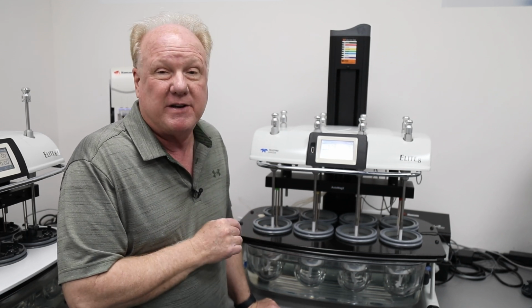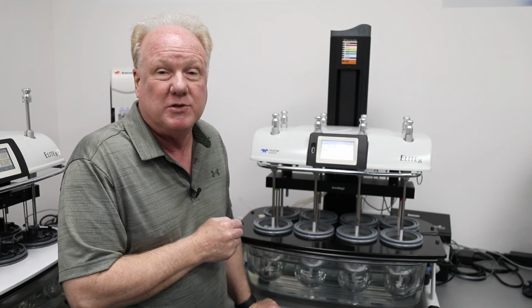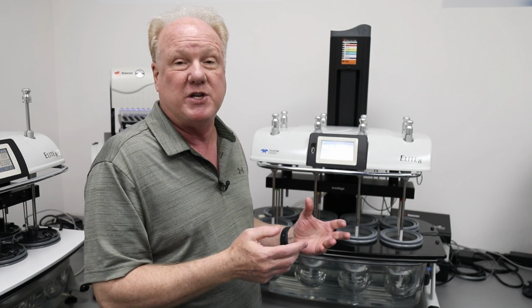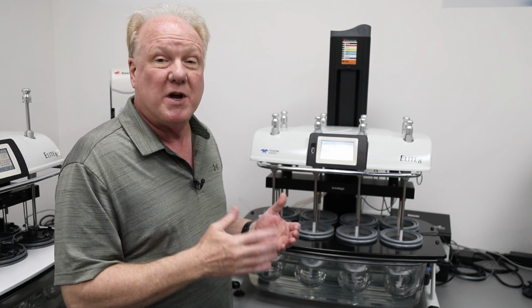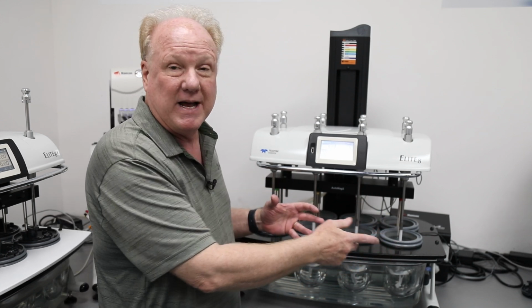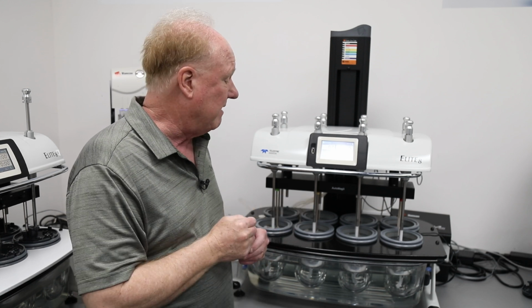That is a very effective way to degas solvent. It works very well. However, other labs use other approaches. It's up to you as a user to decide which approach you're going to use and which is effective. Once you've degassed your media, you want to use it as soon as possible. If the media is simply sitting on the bench, again, it's going to be reabsorbing gases from the environment.